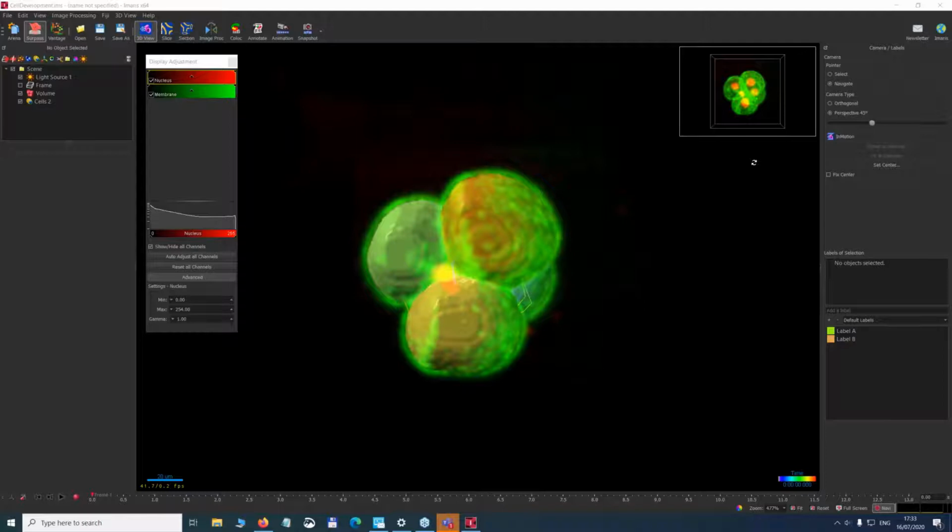So we do have another one that's come in that's interesting, and it's why would you choose maximum overlap here as the option for tracking? And I think we might answer this together, but you can get started if that's okay. Oh, you can go ahead.